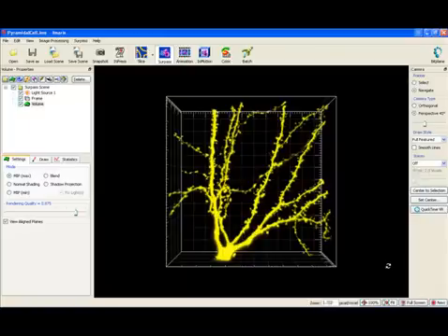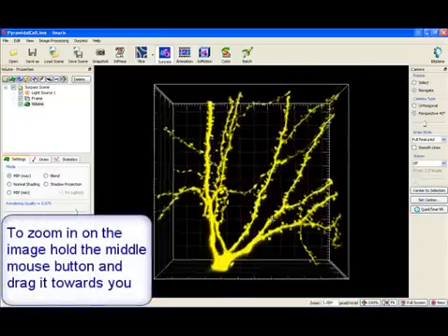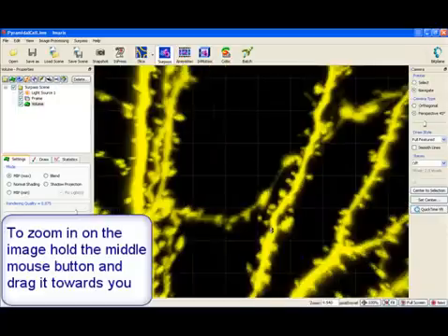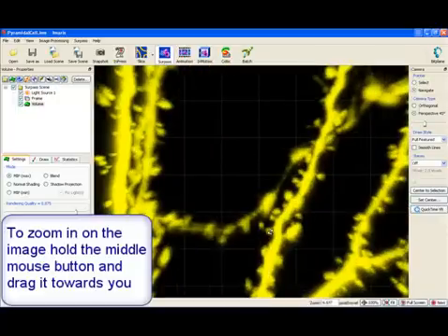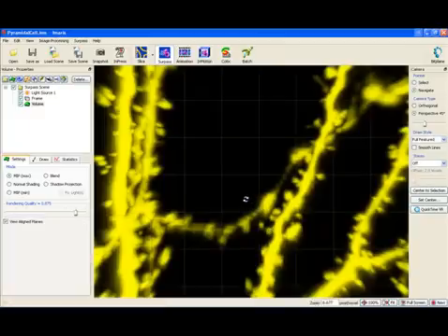Hold the middle mouse button, drag it towards you and zoom in on the image. For additional image visualisation you can combine image scaling with the rotation.